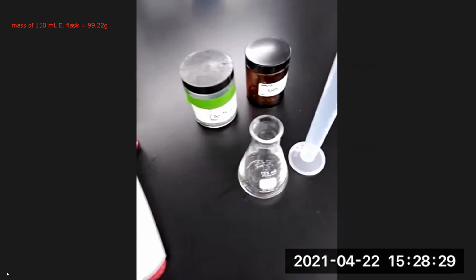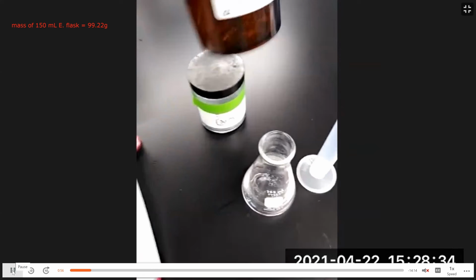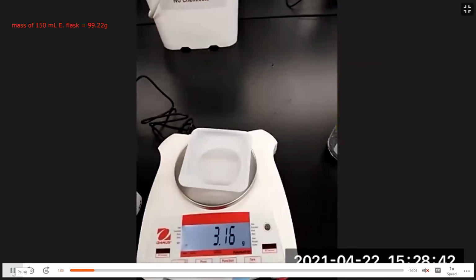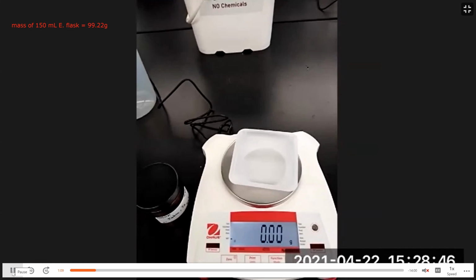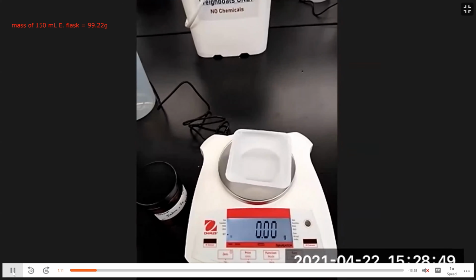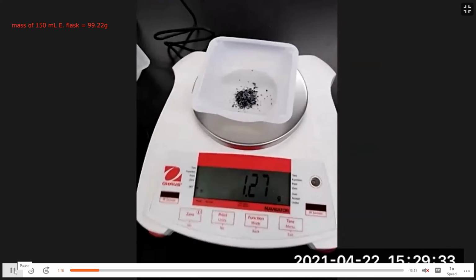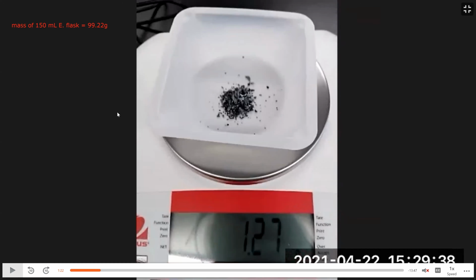We should weigh out 1 gram of iodine into the flask. So for my example, I weighed out 1.27 grams of iodine.